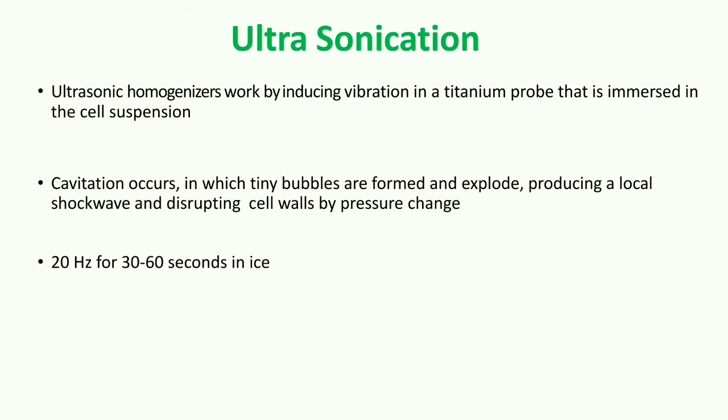Alternatively, high frequency ultrasonic waves can be used for cell disruption. Due to the ultrasonic oscillators, a transient pressure is generated. Alongside, a lot of heat is generated when cell disruption is being carried out. Usually 20 hertz for 30 to 60 seconds in presence of ice can create enough shearing force to disturb the cell architecture.